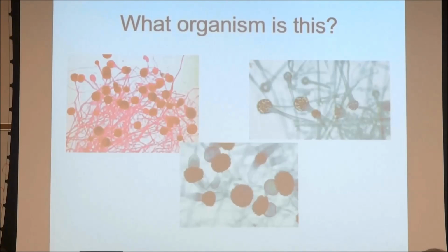So spores go with what kingdom? Fungi. Thank you. Fungi. What kind of fungi is it? Tricky one. What kind of mold? Black bread mold. So the technical name is Rhizopus. How did you know?